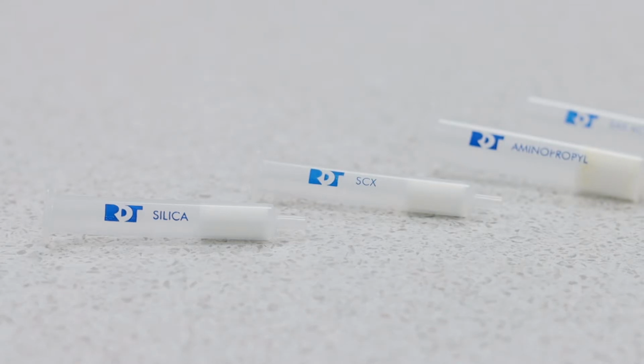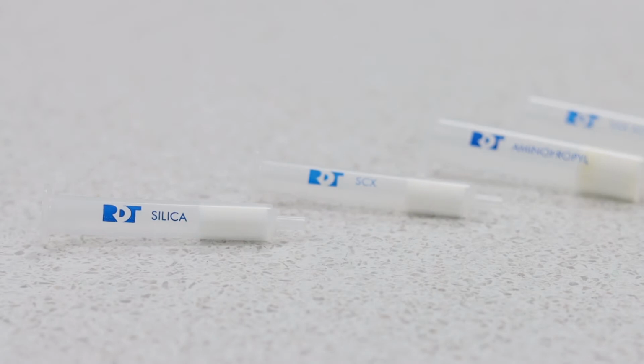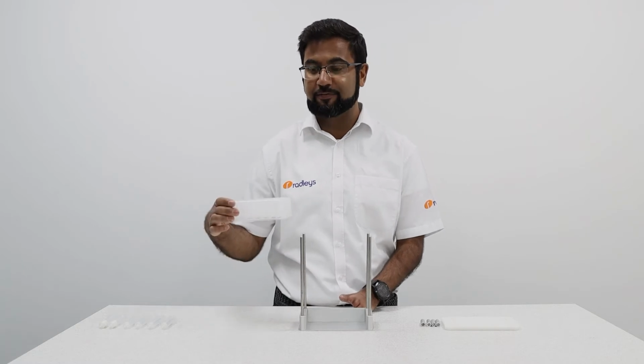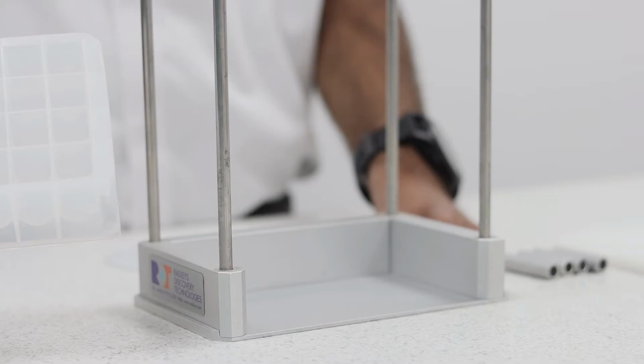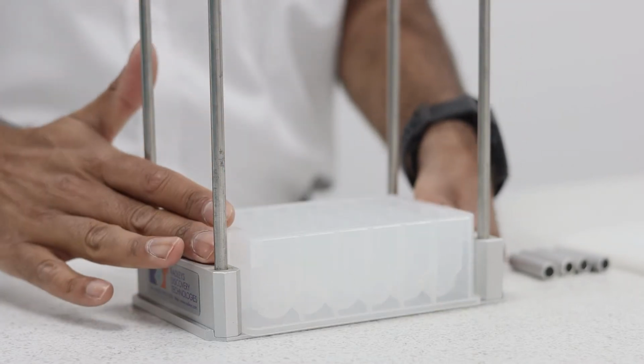The choice of column depends on the properties of the compound you're trying to purify and the nature of the impurities. Now I'm going to show you how to set up your greenhouse workup station. First, you need to select your collection platform, whether it's a deep well microtiter plate, a vial rack, or a greenhouse reaction block. Place it inside the workup station base.